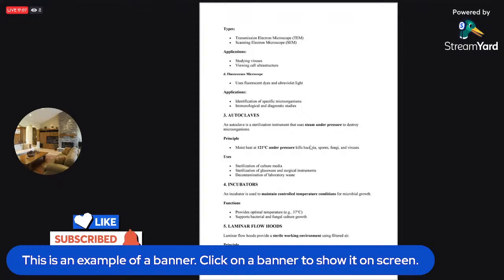Now incubators. An incubator is used to maintain controlled temperature conditions for microbial growth. So autoclave is sterilization of equipment, sterilization of culture media, sterilization of waste under high pressure in order to remove microorganisms from your samples. So that is that. Then incubators.